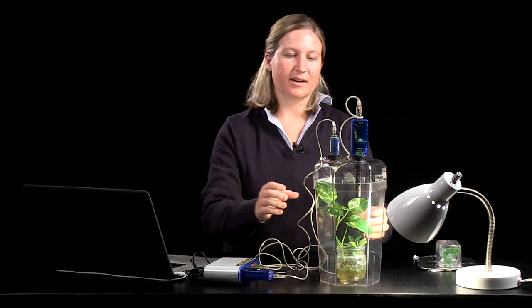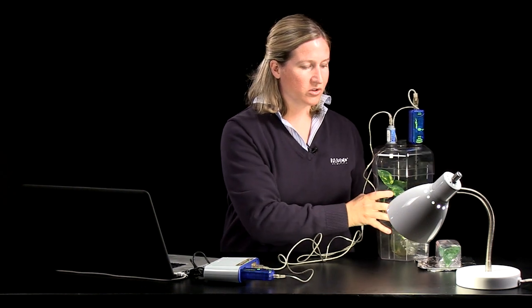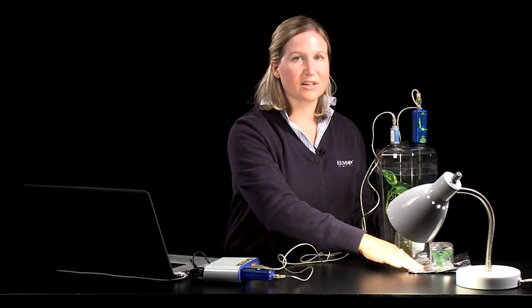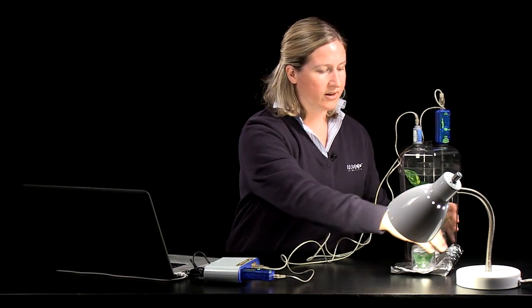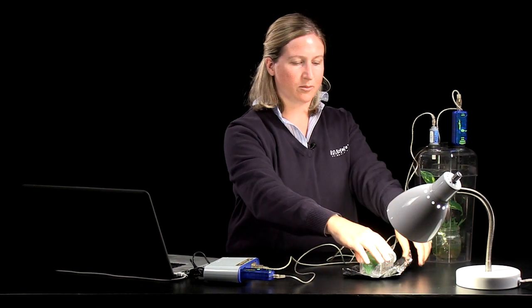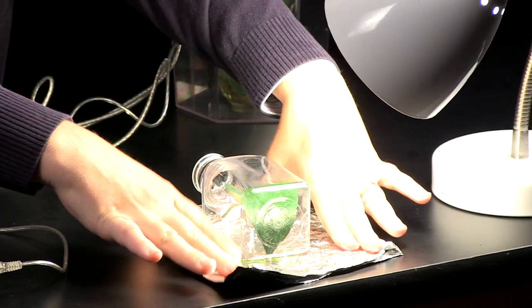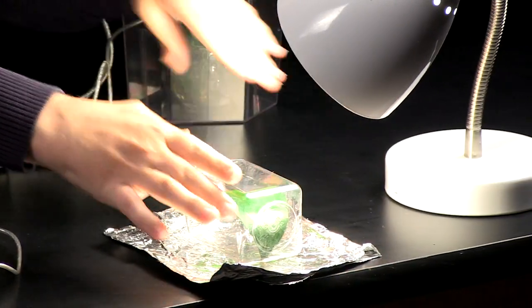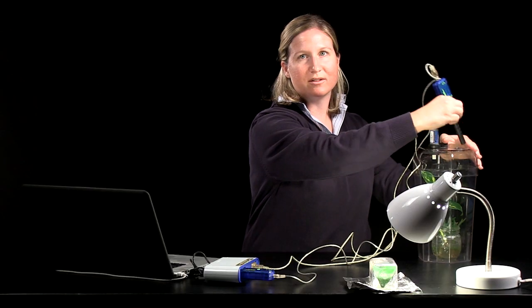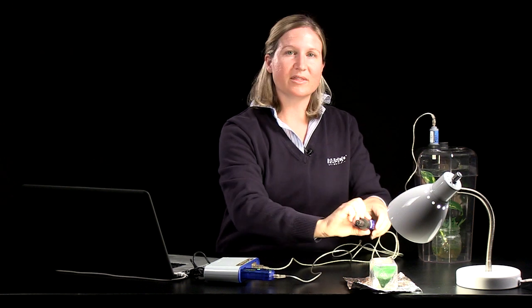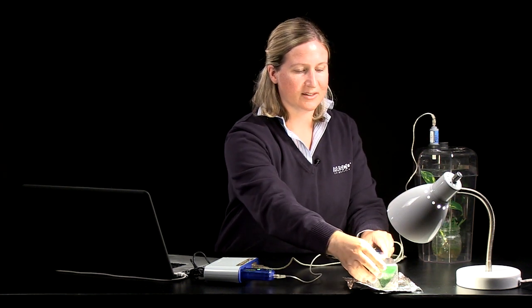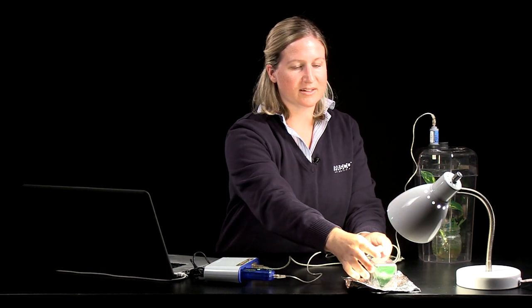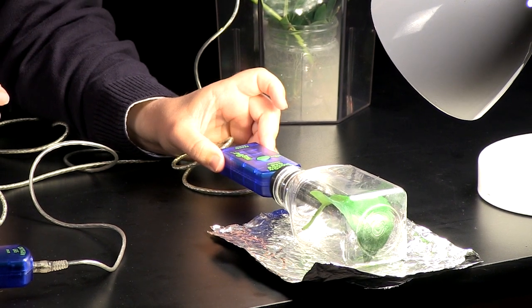On a smaller scale you can have students use a green leaf or a couple leaves like spinach and you can put those into the sampling bottle under direct light and for this smaller scale experiment that only takes 10 minutes or even less than 10 minutes you can plug the sample bottle with the carbon dioxide sensor and students can investigate the rate at which carbon dioxide is taken in by the plant and get a rate of photosynthesis.